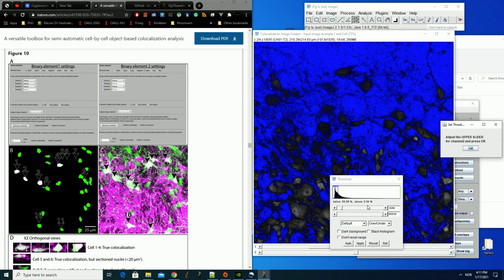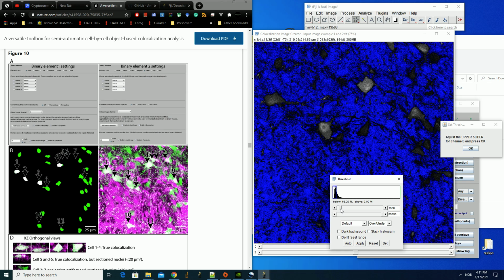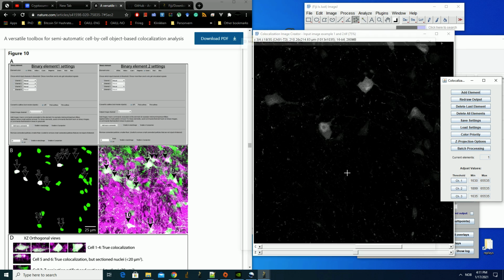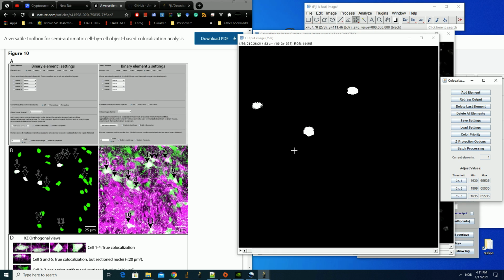like so. Of course, this is dependent on the quality of your image, and you can do some pre-processing to do binarization, or even improve the signal yourself.